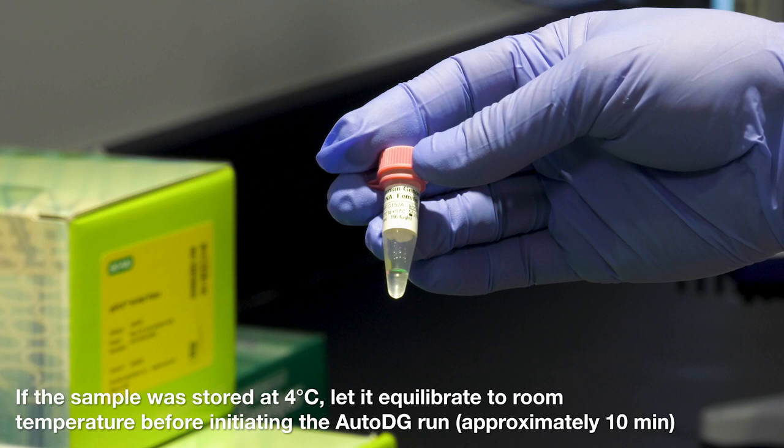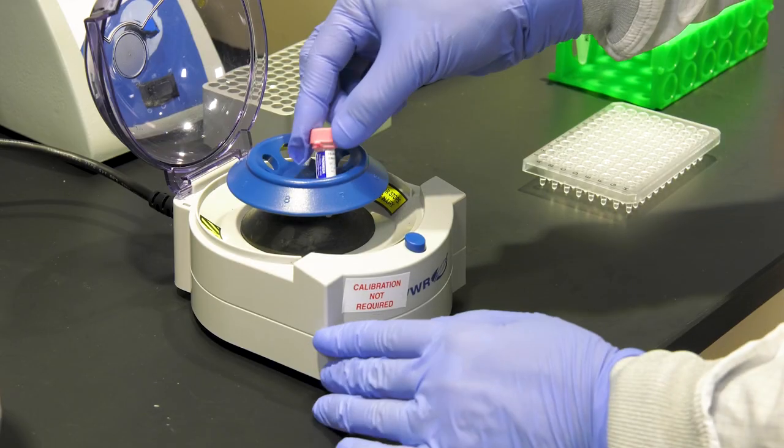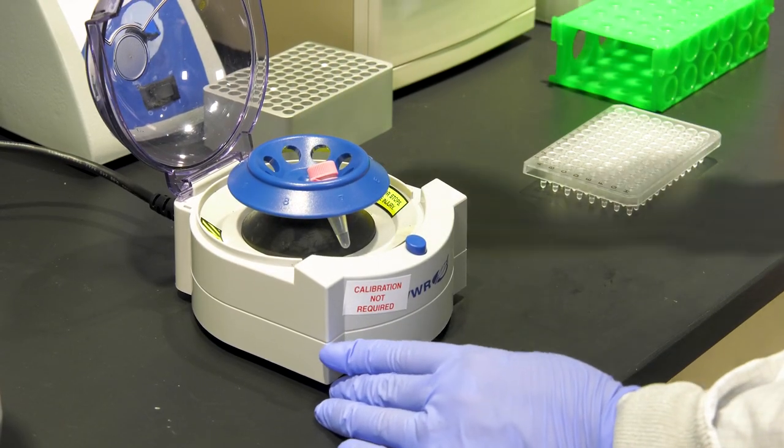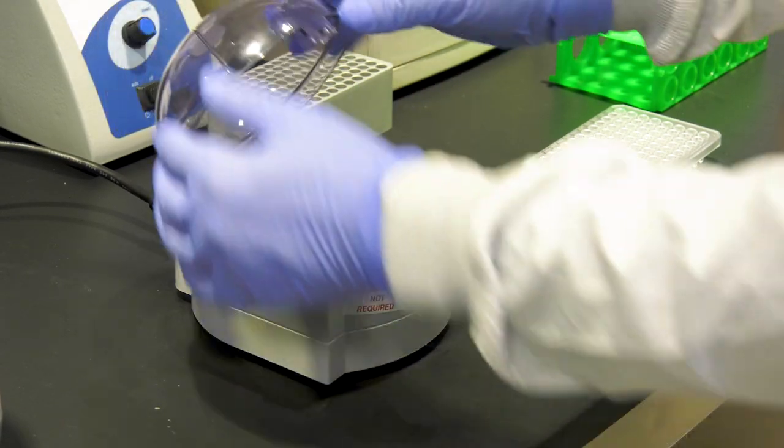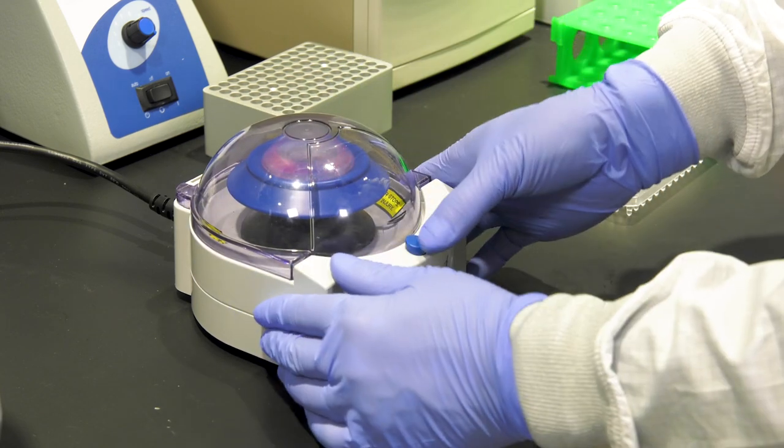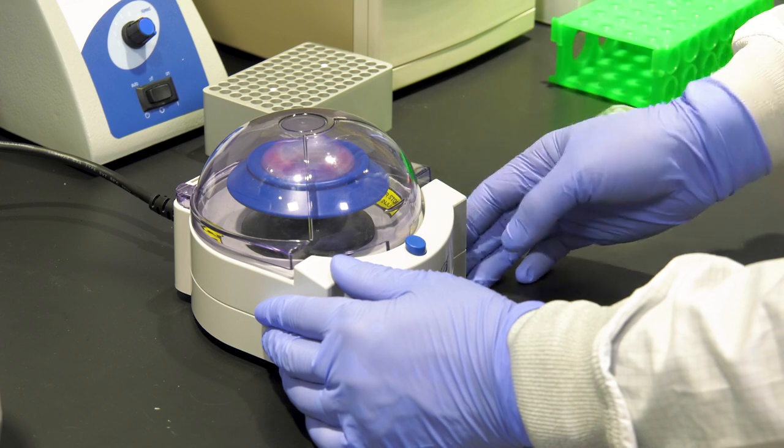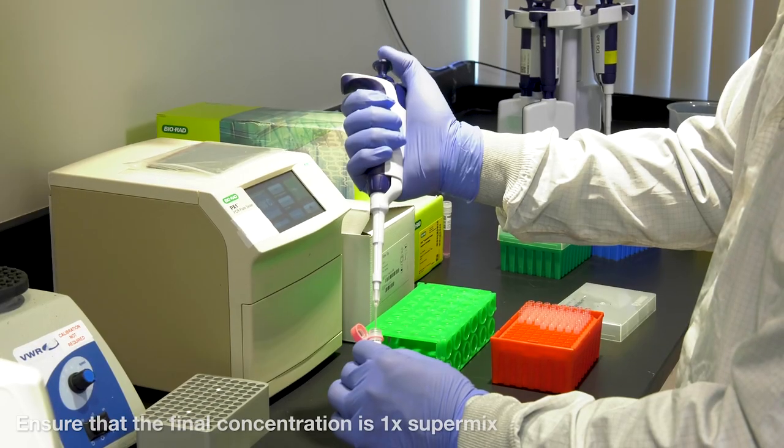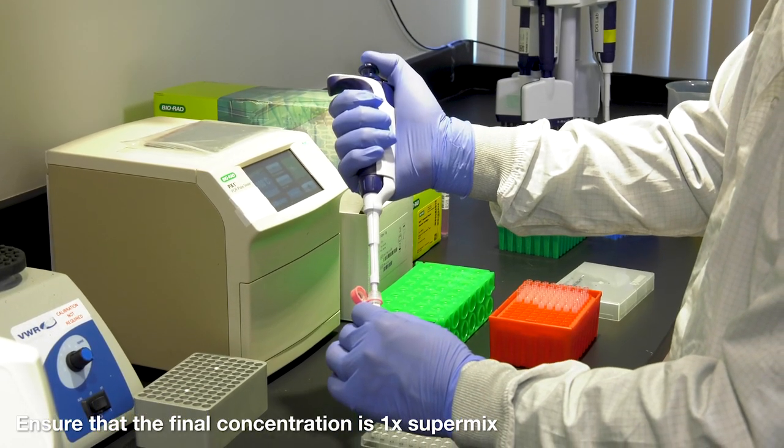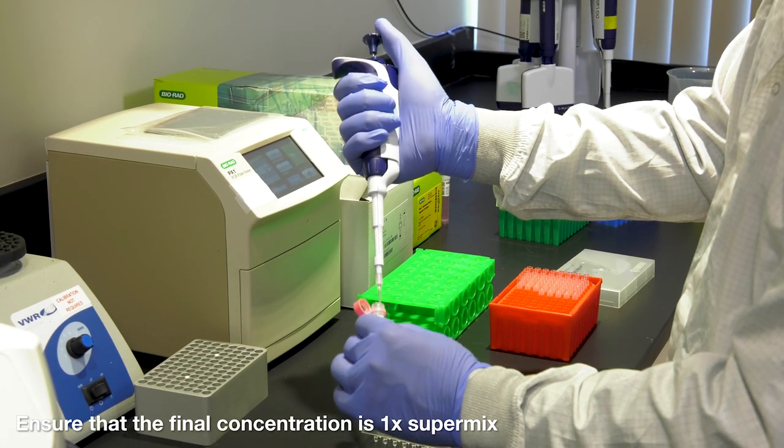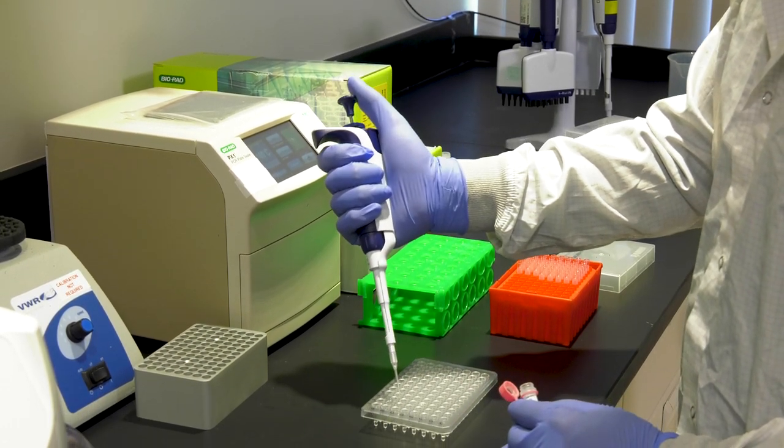Finally, make sure that the final component, the nucleic acid template, has equilibrated to room temperature if it was stored at 4 degrees Celsius or that it's completely thawed if it was in the freezer. Give the tube a quick mix and spin in a tabletop centrifuge. Then, add the appropriate amount to bring the final reaction mix in the 96 well plate to a 1X concentration.